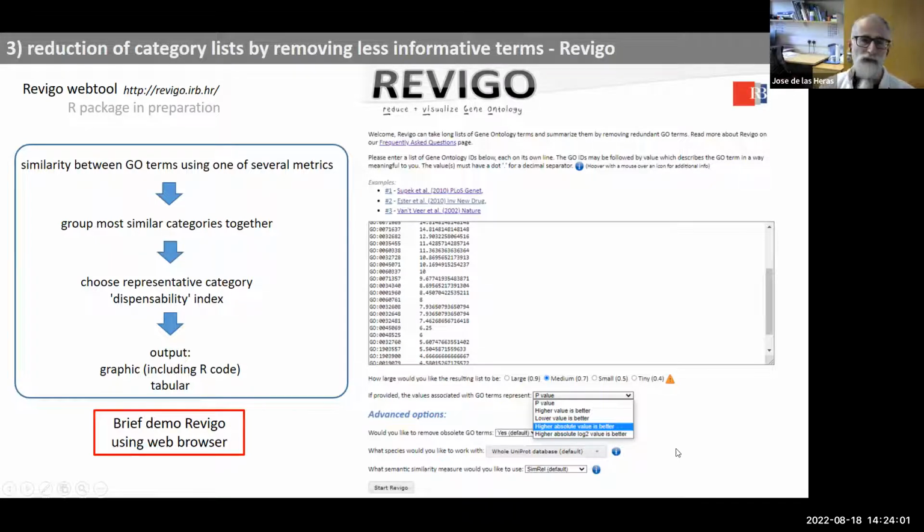So there are several ways to do this. I've come across various packages that claim to do this, but I was never really satisfied with any. So I was doing my own version, which I'm going to show you next to this, because recently I came across this, and I think it does it quite nicely. The only caveat is it only works for gene ontology, so biological process, molecular function, and cellular components.